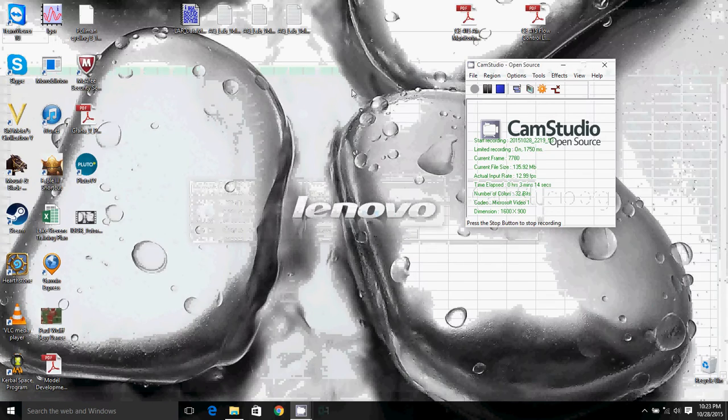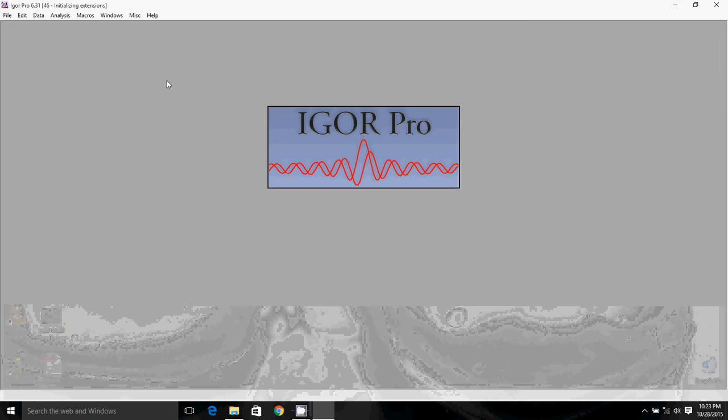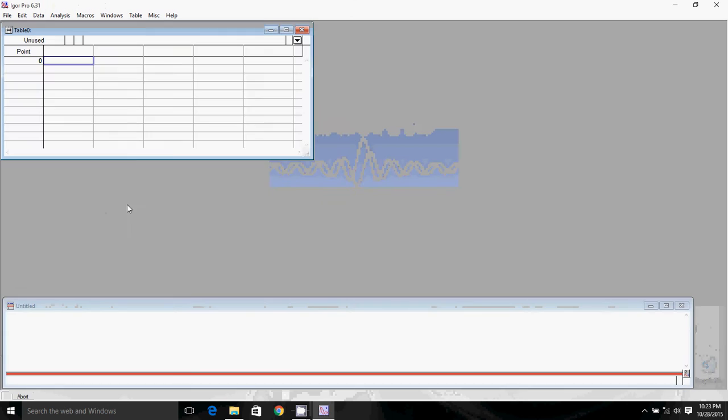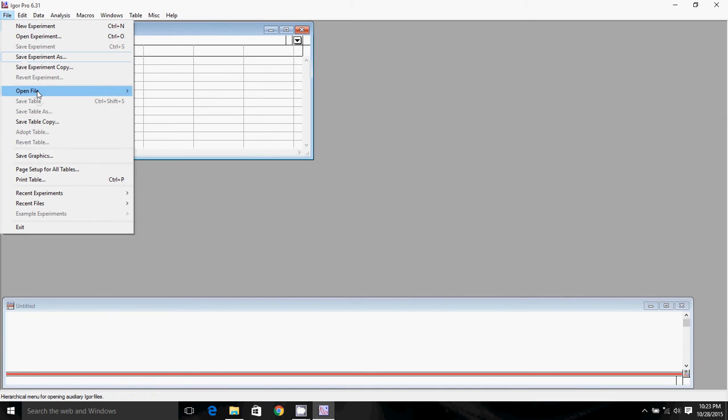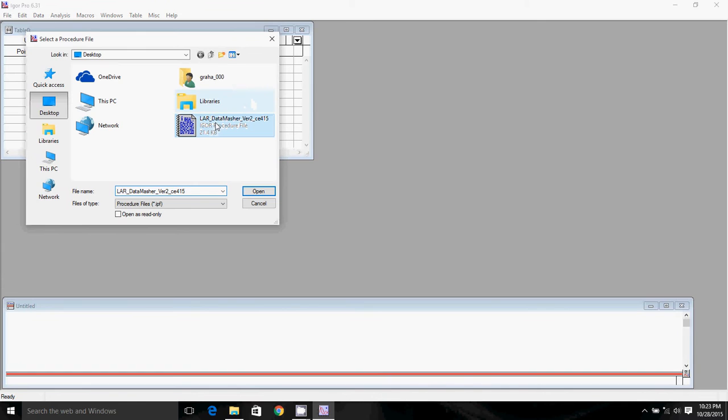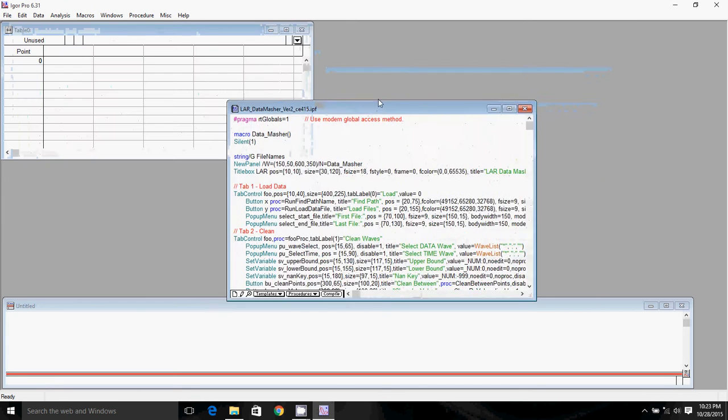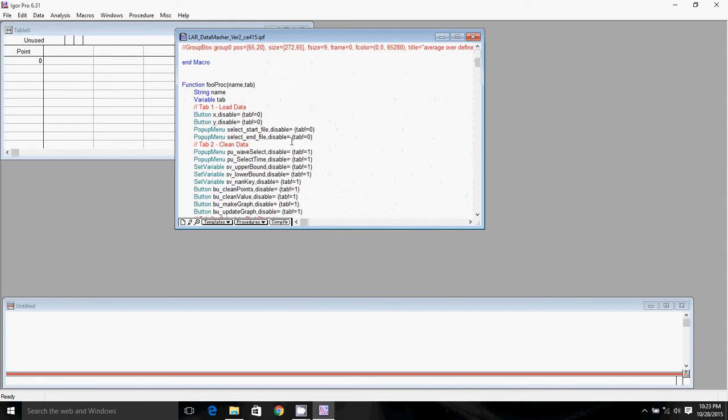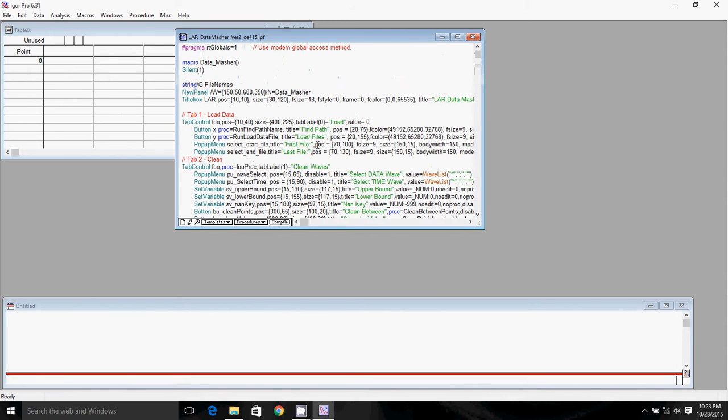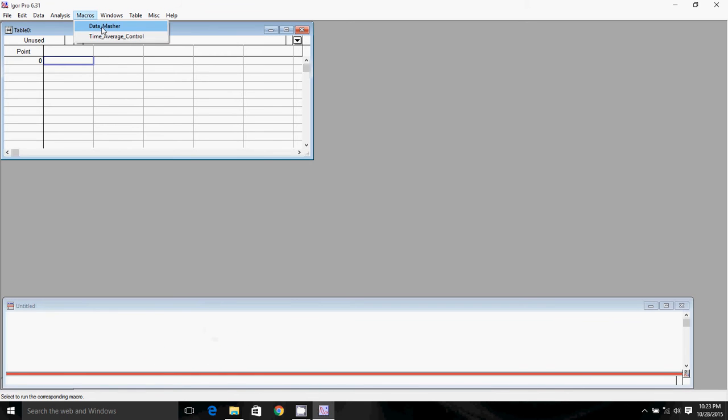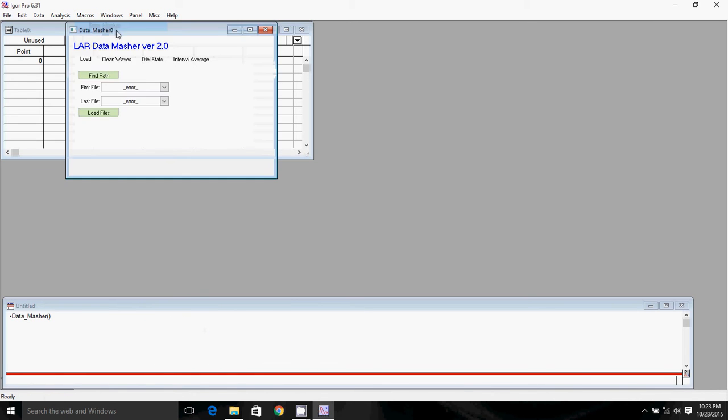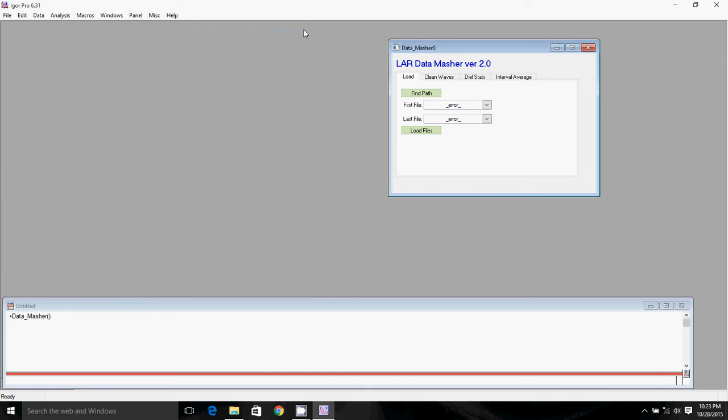Igor has built-in functions for getting data into it internally, so we're going to go ahead and just open Igor itself. And we're going to use the function in the LAR data masher to pull data into Igor. So we're going to click file, open file, and procedure to open the LAR data masher procedure. I already have it on desktop here, so I'll click open. Here we have all of our code. We're not really going to have to deal with the code at all. We'll just go ahead and minimize that, and then we'll click on the macros tab, and we'll click the data masher macro, and then we have our data masher control panel right there.